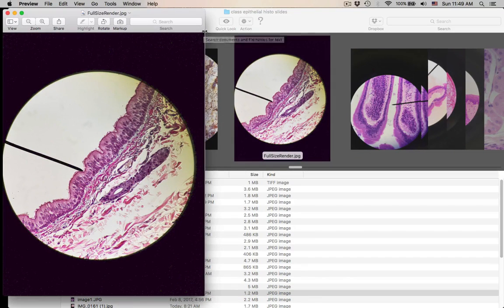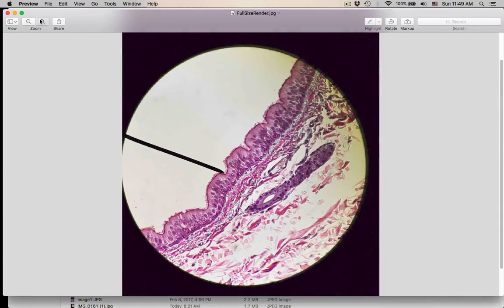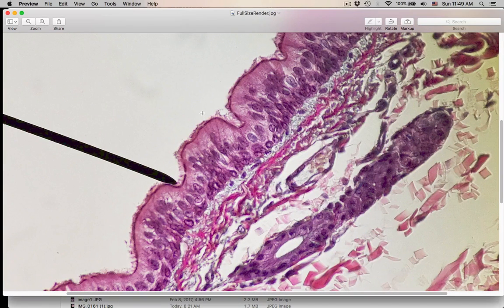This is number 17. This apical surface modification that the pointer is on. You can see this is cilia. They kind of stick out. They're fairly easy to see once you get used to seeing them. Does not look like microvilli or a brush border. These are individual little hair structures. Cilia. So that was number 17.